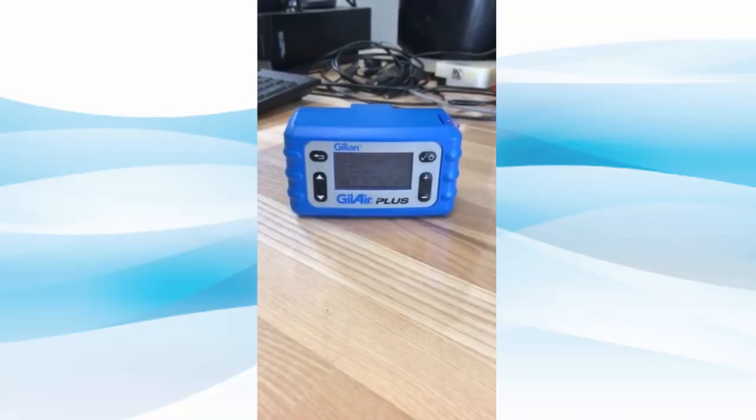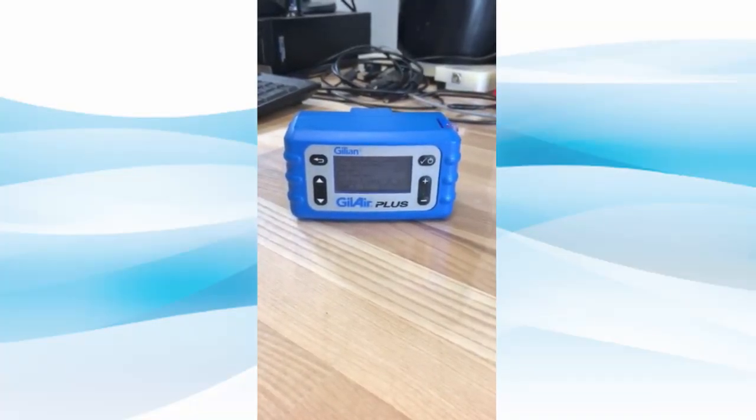Today we are going to demonstrate a bag fill operation using our Gillian Gillair Plus pump.